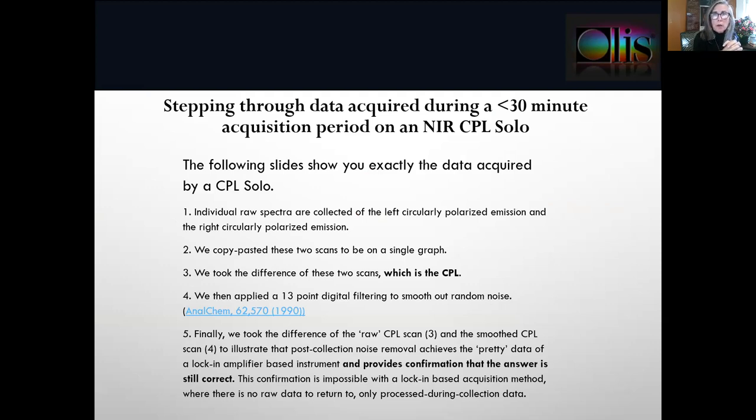Stepping through data acquisition of the spectra — they took about 30 minutes to collect. The first scan shows the raw spectra of the left circularly polarized luminescence, then the right circularly polarized luminescence. We put these two scans over each other on a single graph. Then we took their difference, which is CPL by definition. Fourth, we applied a smoothing algorithm so the data are a little prettier. Finally, we took the difference of the raw answer and the smoothed answer so you could see that smoothing did not change the structural information at all. This reversible confirmation is unavailable from any other CPL spectrophotometer.